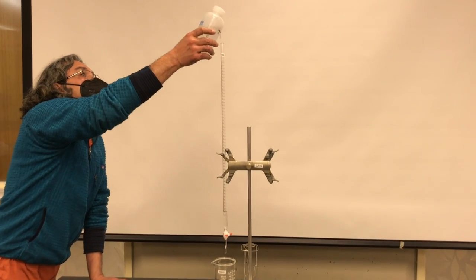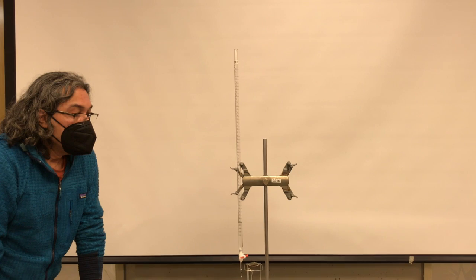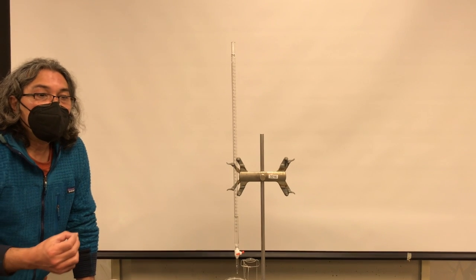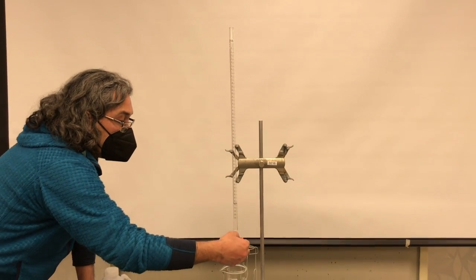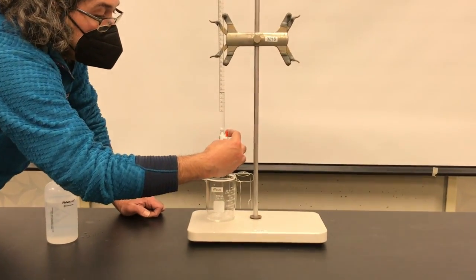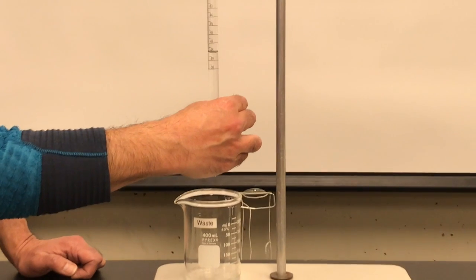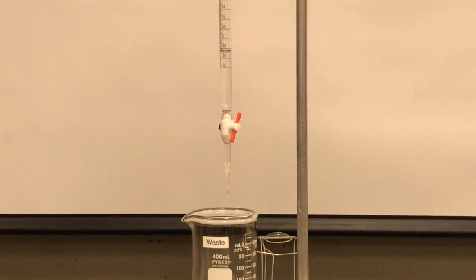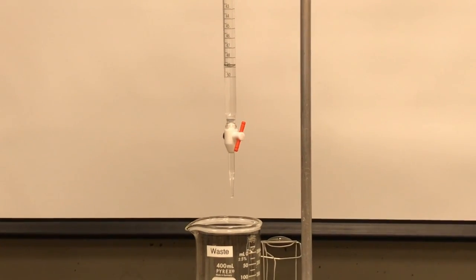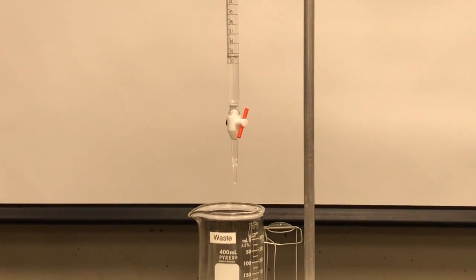I'm going to put just a little bit more water in the burette, and I'm going to practice playing with the valve to be able to get a controlled flow rate. I'm going to first open it all the way so you can see how fast the liquid flows. Then I'm going to close it slowly till I achieve a drop by drop flow rate. This is the speed that you're going to want to use when you're doing your titrations.